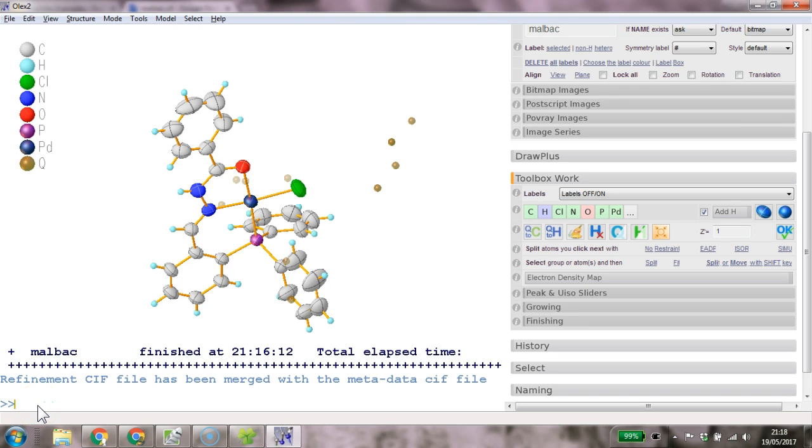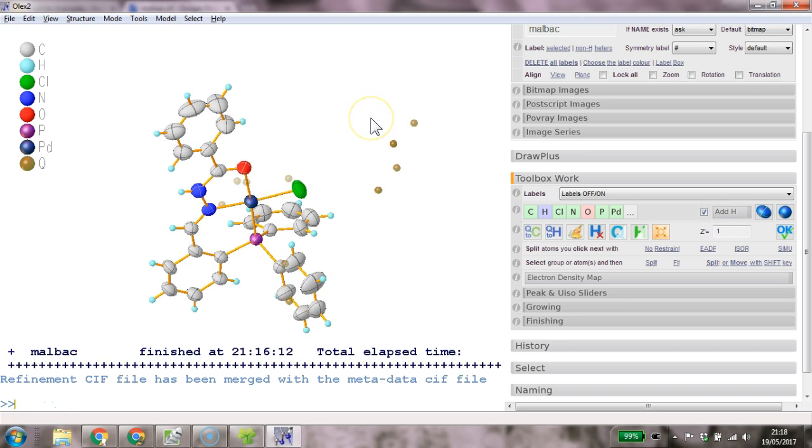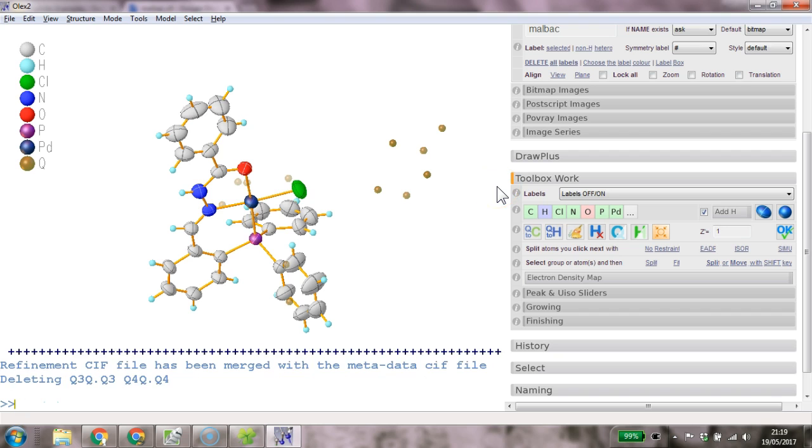I am now trying to achieve the same result by a slightly different technique, which is much less forgiving and can be quite troublesome, but let's try whether we can do this. Control-G to grow these peaks again. And then we like to isolate something that looks like what we want. So we've got these ones here, we name them C, and the point now is we go PART -1 and the magic -C.